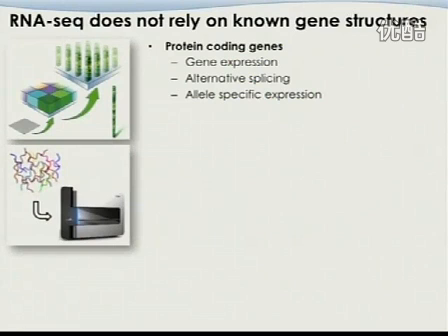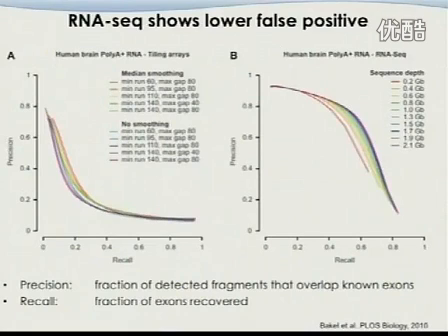No, it's more about the statistics and the biochemistry part. There's not too much bioinformatics in that paper at all. So you are asking why it performs better in RNA sequencing. Both the biochemistry part and the analysis part are the key factors. And we are not yet talking about how much time it takes to run this analysis.